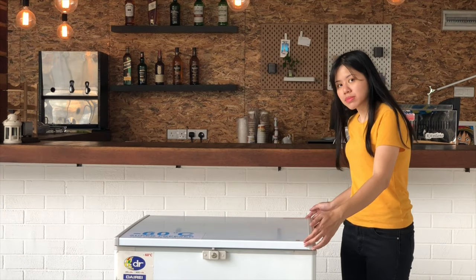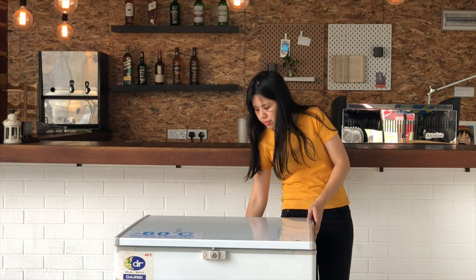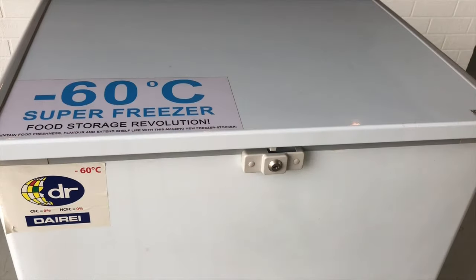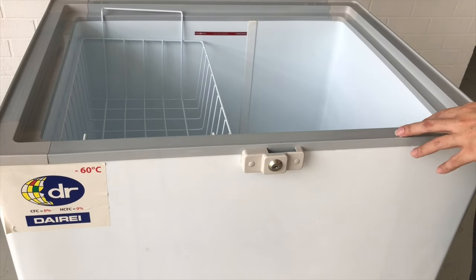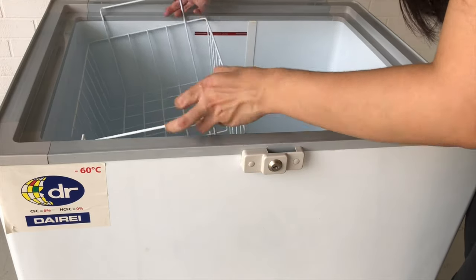Let's start with the basics. The dimensions are 820 by 705 by 865 mm. It uses a 15-amp three-pin plug. Let's take a look inside — this freezer has a capacity of 210 liters and it comes with a basket.